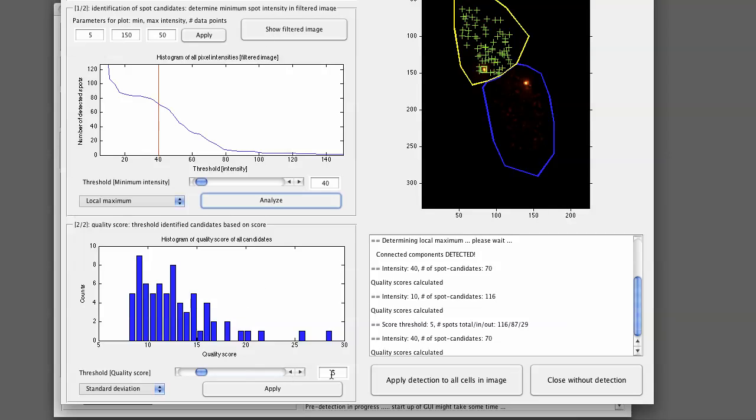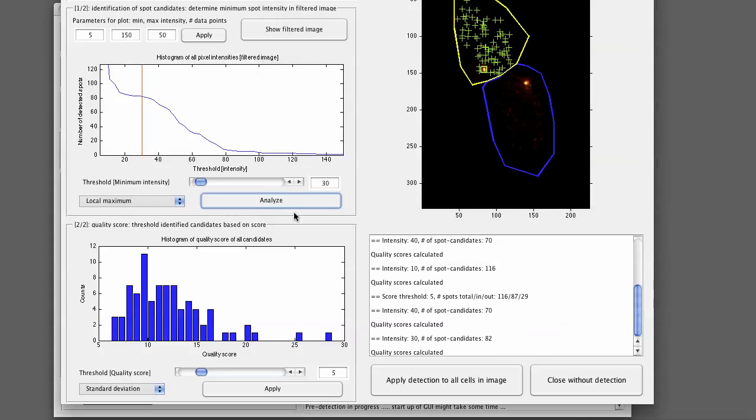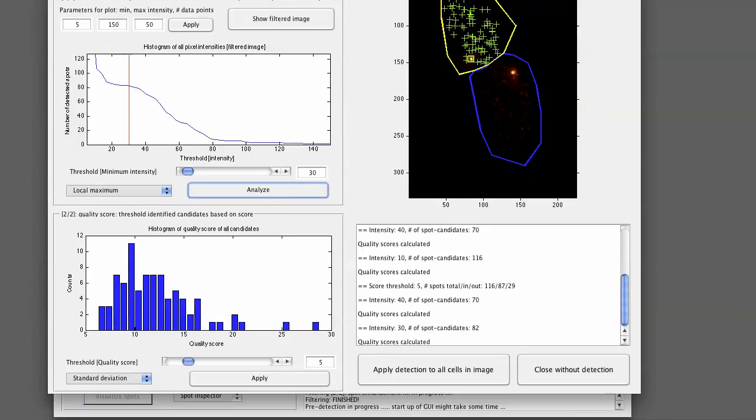In combination with a quality score threshold, we get a good detection. We can even go lower here to 30. We see that we still have some room. So this intensity threshold we usually place somewhere in the middle of this plateau. Then we set an according quality score. It's optional.